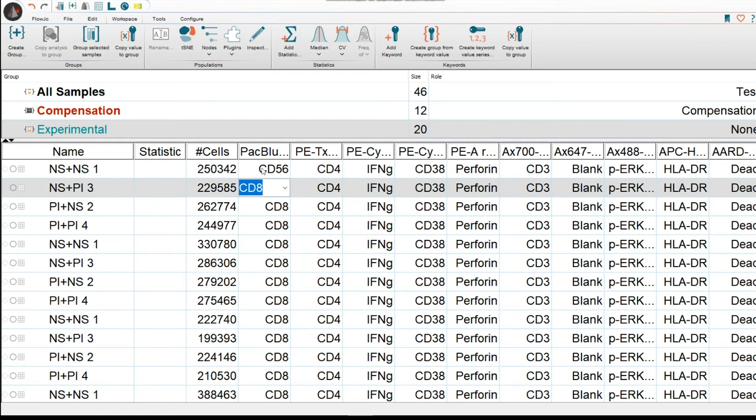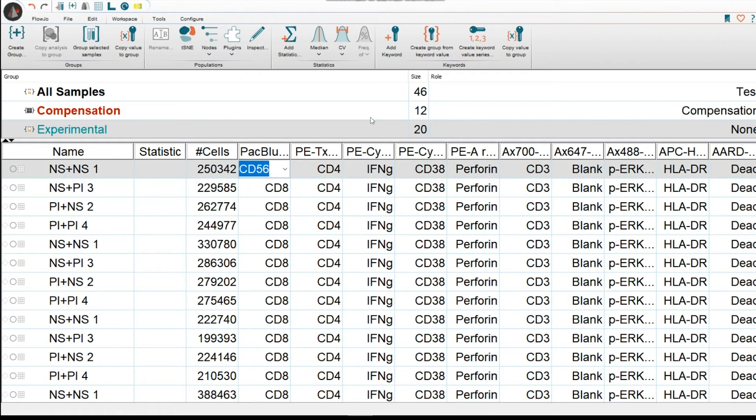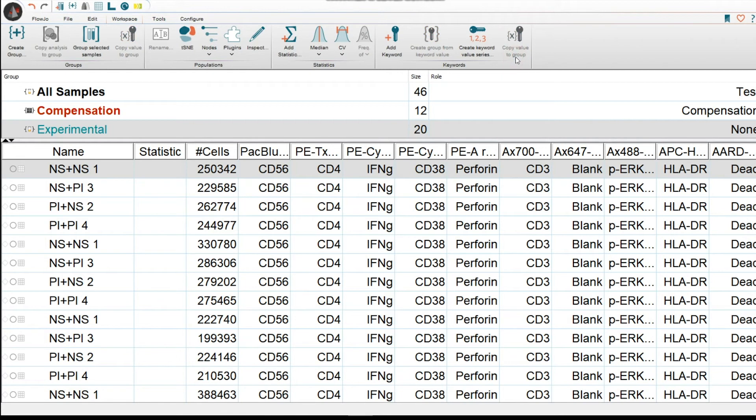However, you wouldn't want to do this for every single sample. So the way you copy it to all your samples is, you will select that keyword, and then click on Copy Value to Group. Now all your samples are labeled with CD56 corresponding to the parameter of pac blue. You will do this with all your parameters. That way, everything is fully labeled.